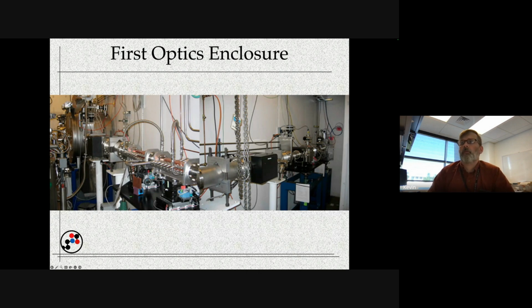And so at the beamline, they'll typically have what we call a first optics enclosure. In this picture, from the right-hand side, this portion over here is the wall where you would go into the storage ring on the other side. And then on this side where the picture is being taken, you start getting the experiment equipment sitting out on the floor. This is the first part of the beam line that the X-rays are exposed to.